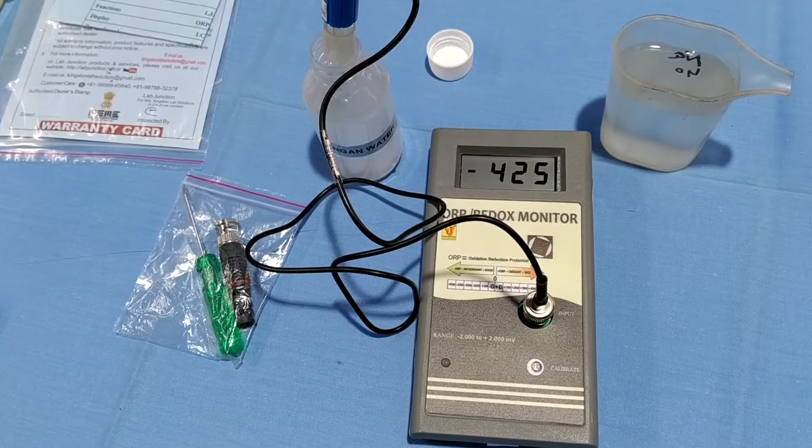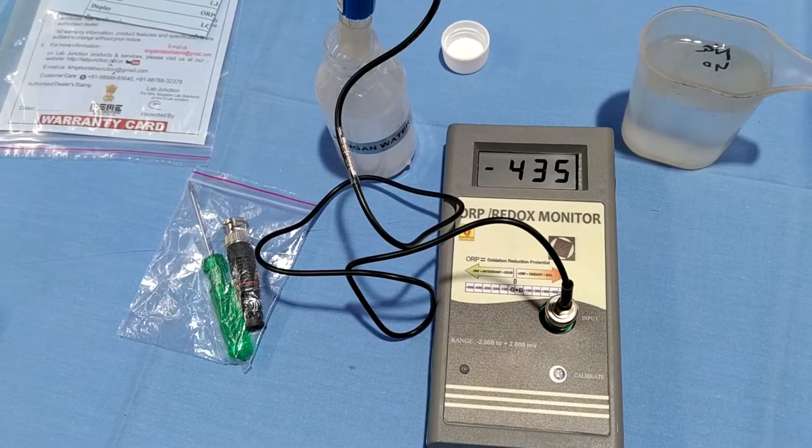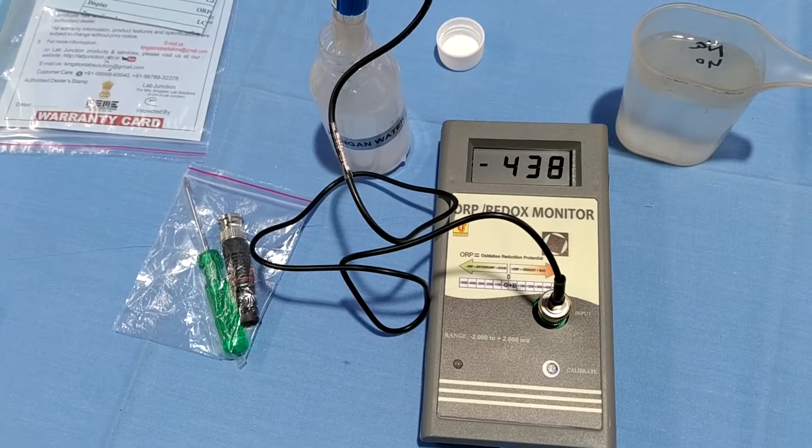This sample goes to minus 400 to minus 500. This sample is good.